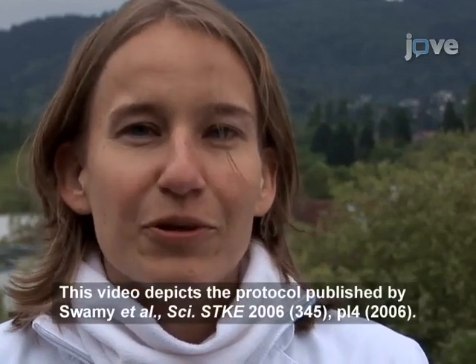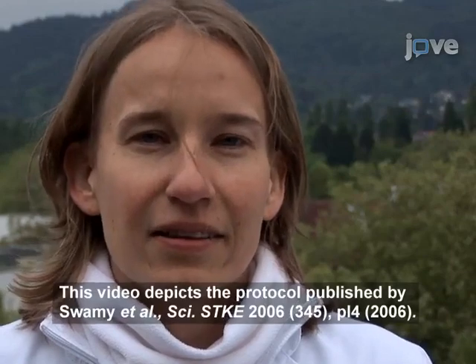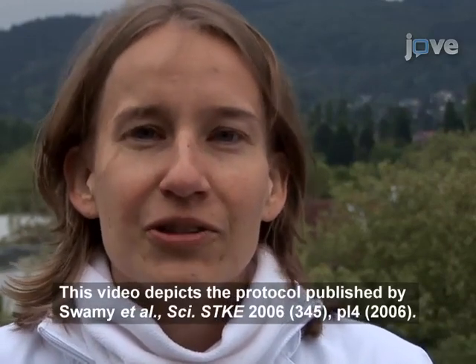Today we will show you a procedure for the analysis of multi-protein complexes from cellular lysates. We use this procedure in our laboratory to study the composition of multi-subunit membrane receptors. However, in this video, we use the eukaryotic proteasome as an example. So let's get started!